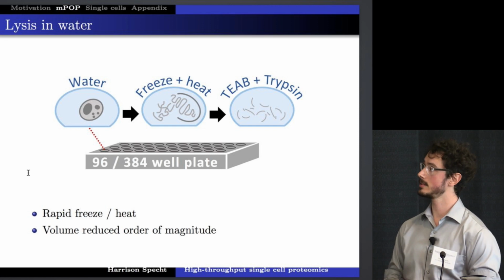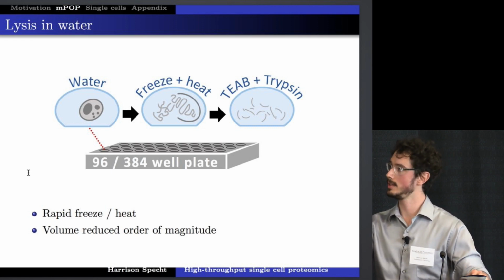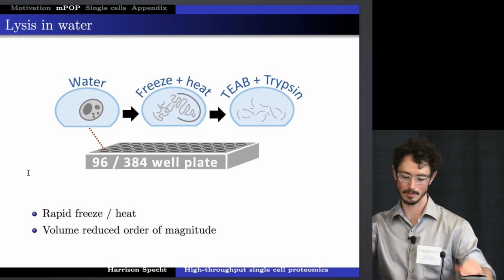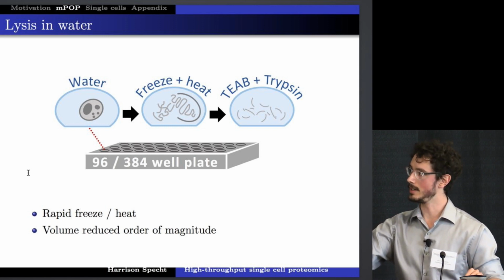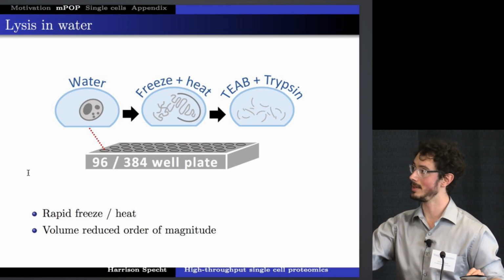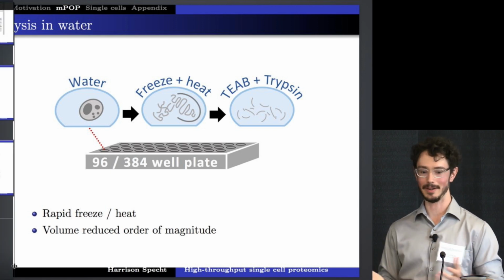Totally obviates it, in fact, if you also include mass spec compatible buffers to adjust the pH and accomplish the digestion from proteins to peptides. This has a number of examples, and I've greatly simplified it here, but we certainly spent a long time iterating over different ways of accomplishing this. It may look unsophisticated, but we've definitely failed at it many, many times, and we have iteratively reached a place where we can accomplish it much better.